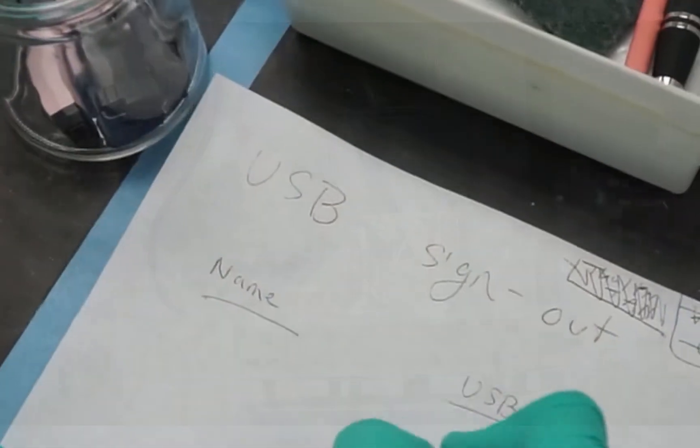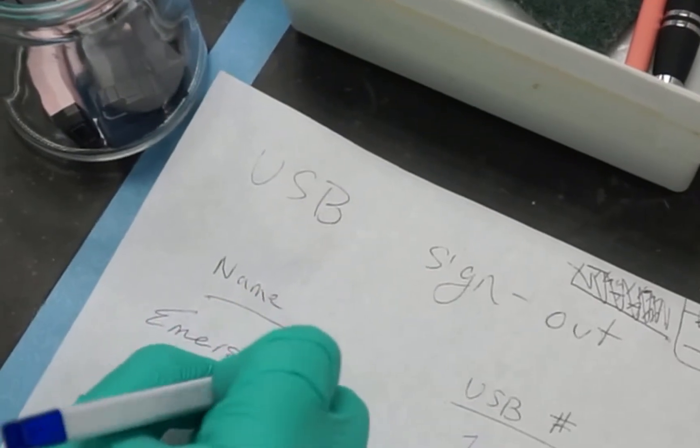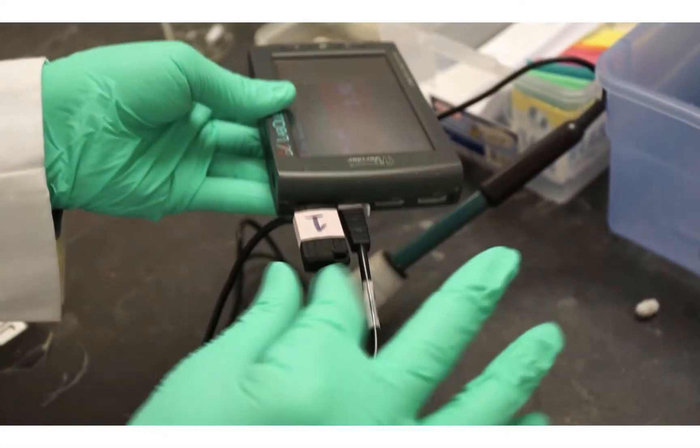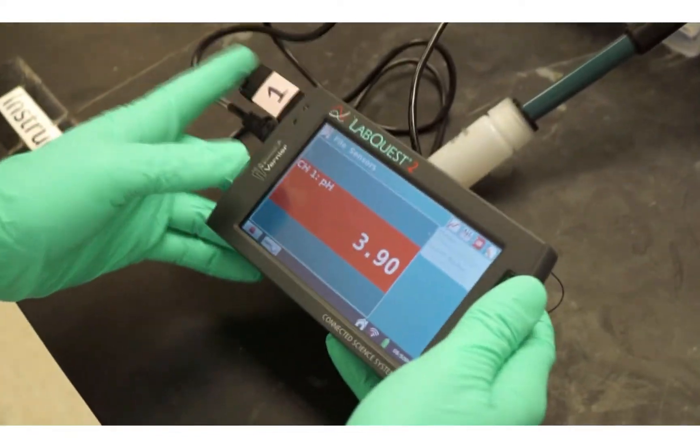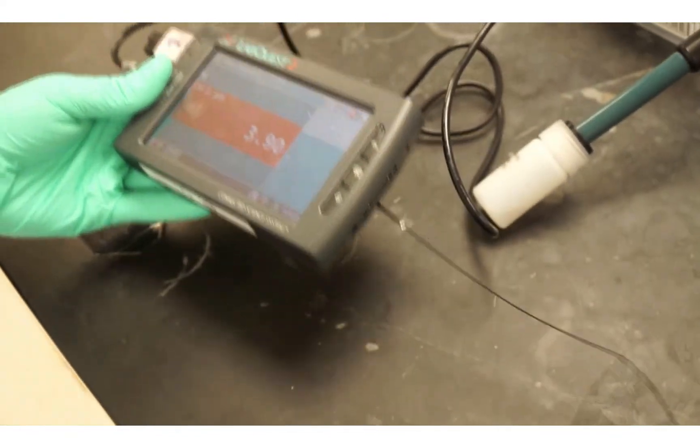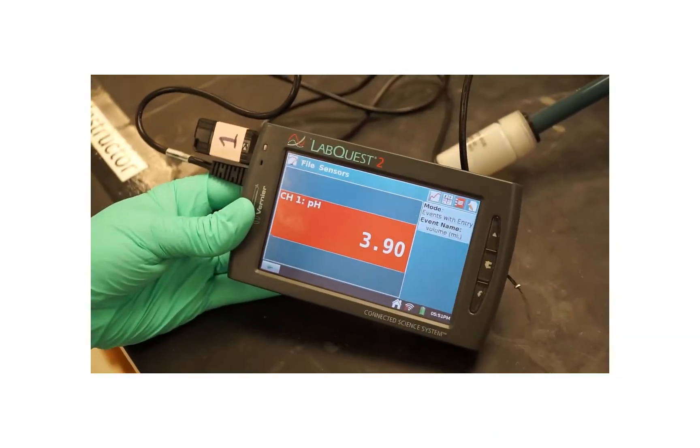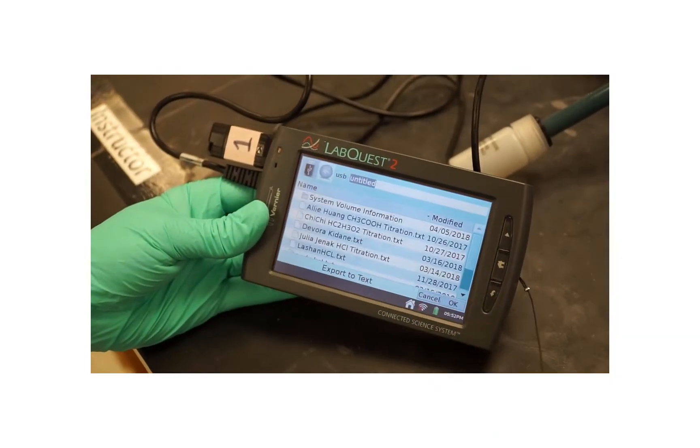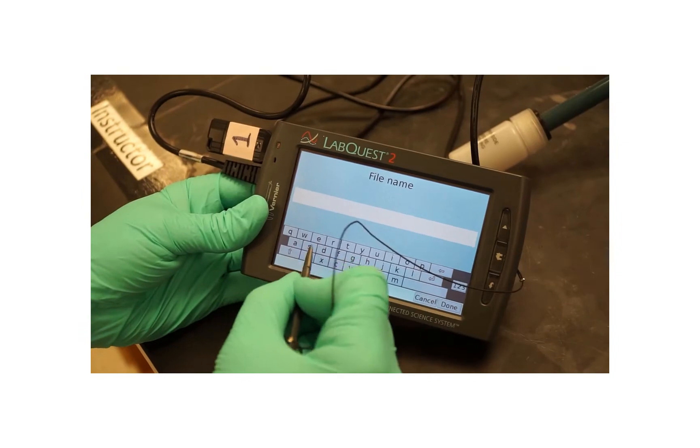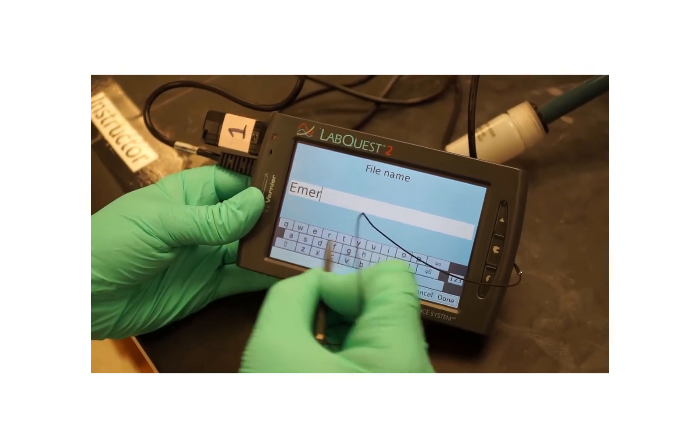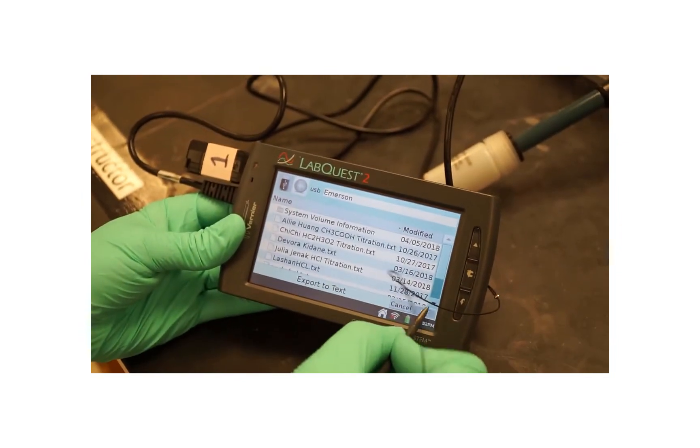Check out a USB drive from the front of the lab. While your collected data is still on the LabQuest screen, insert your USB drive. Export your data to the drive as a text file with your name as the file name. Make sure you choose Export or the data will not transfer appropriately. Click Done, then click OK.